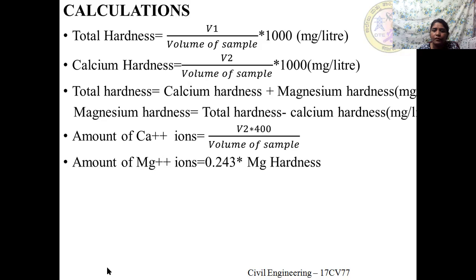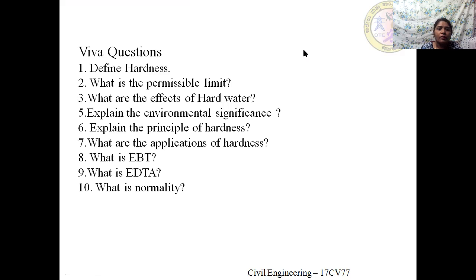Thank you. You need to answer certain viva questions. The viva questions are as follows. What is hardness? Define hardness of water. What is the permissible limit of total hardness? What are the effects of hard water?